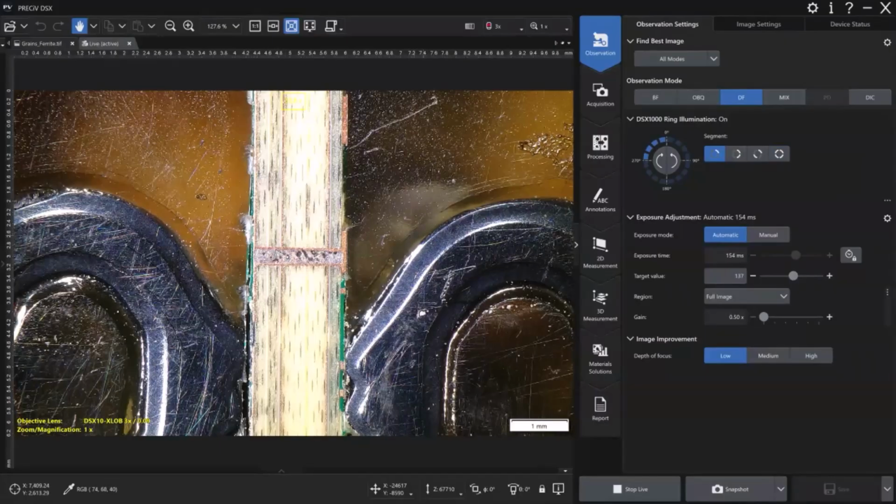The software will let you take a snapshot down here at the bottom at any time. And then there's some advanced tools in here as well, where we can actually show more functions and maybe capture the images at all the different angles of light. That's a case you want to do.